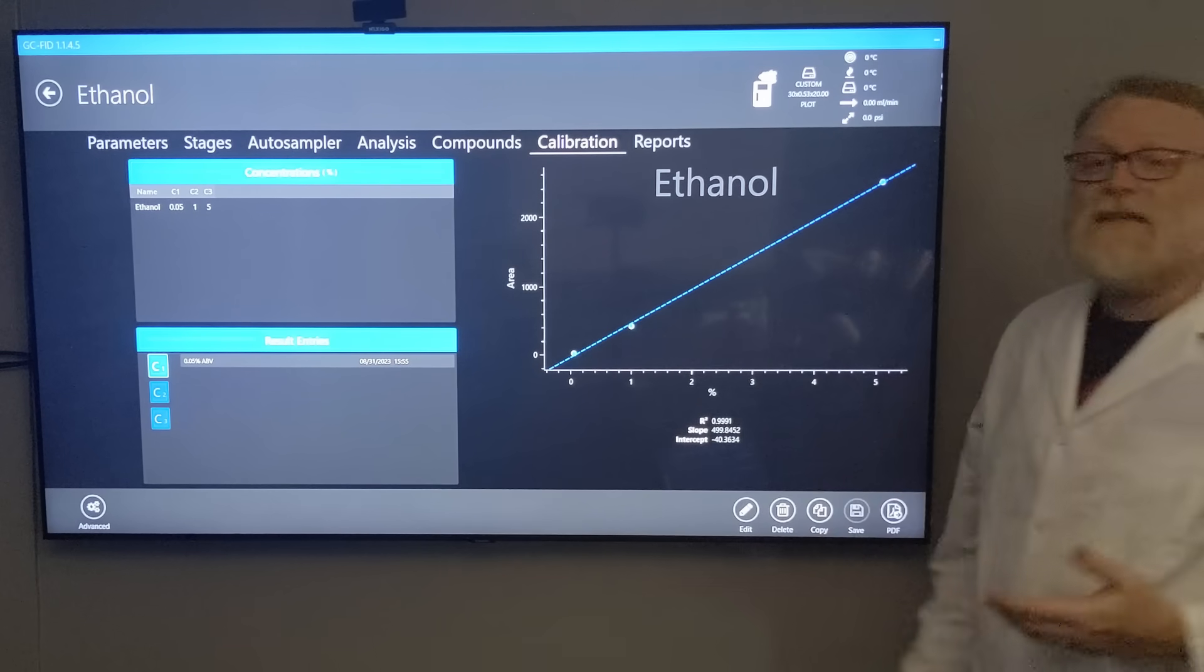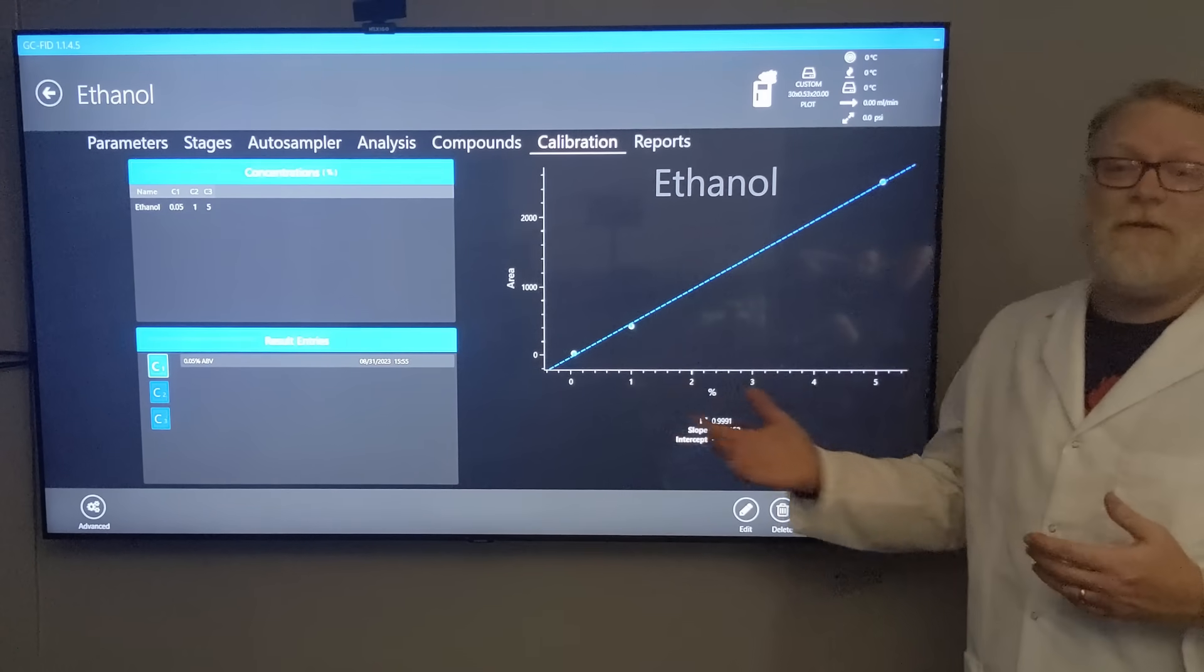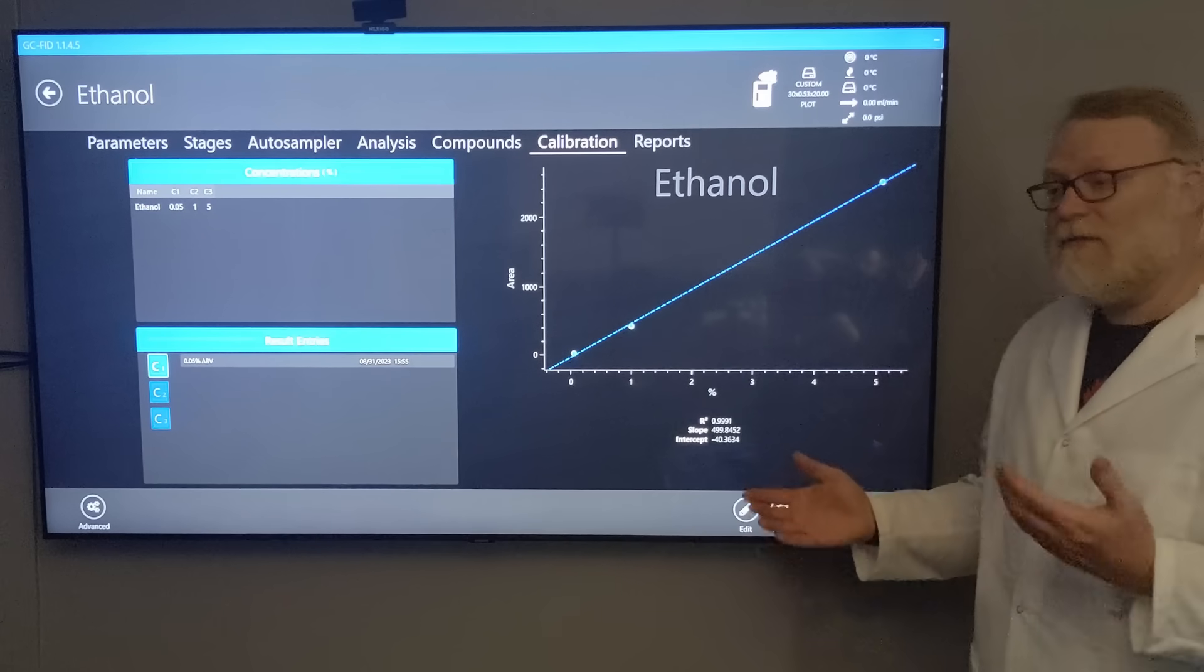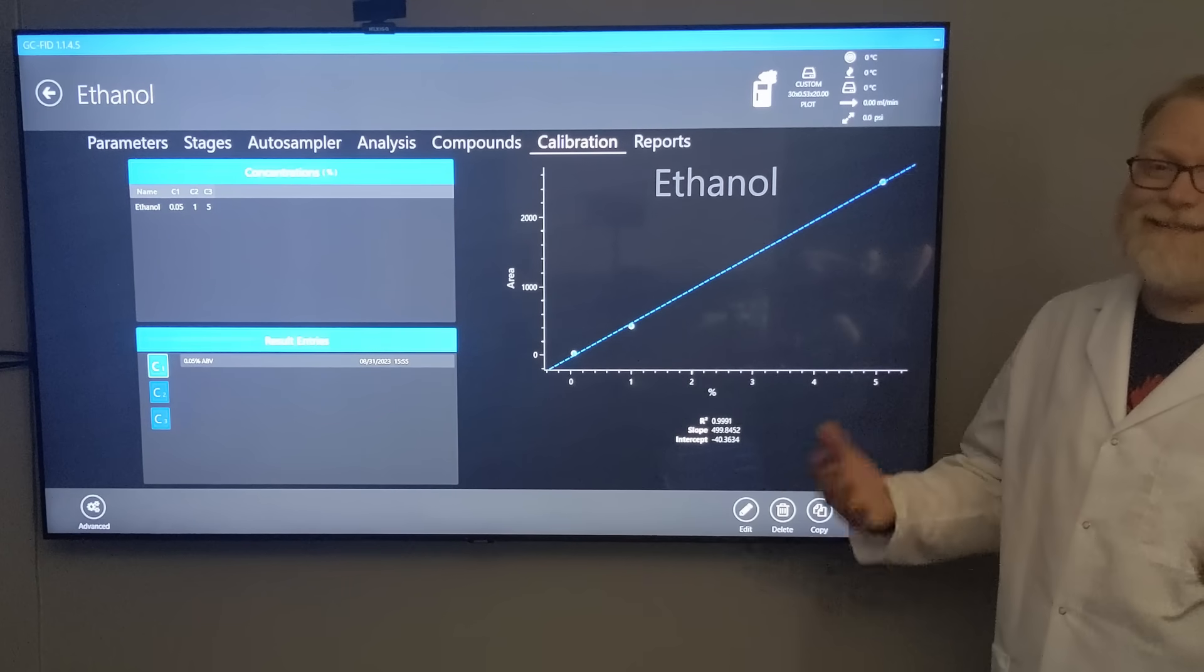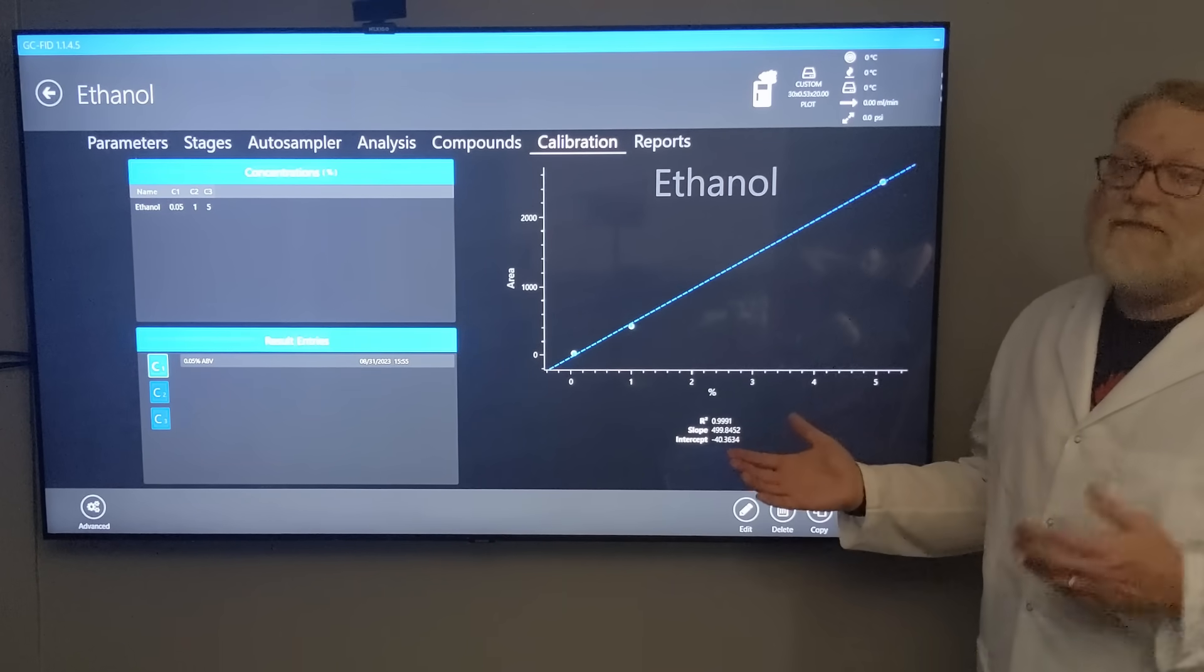It's very difficult to do visually on a graph, but using y = mx + b, we can get an exact point. The great thing is we don't have to do the math - the Lucidity software does it for us.